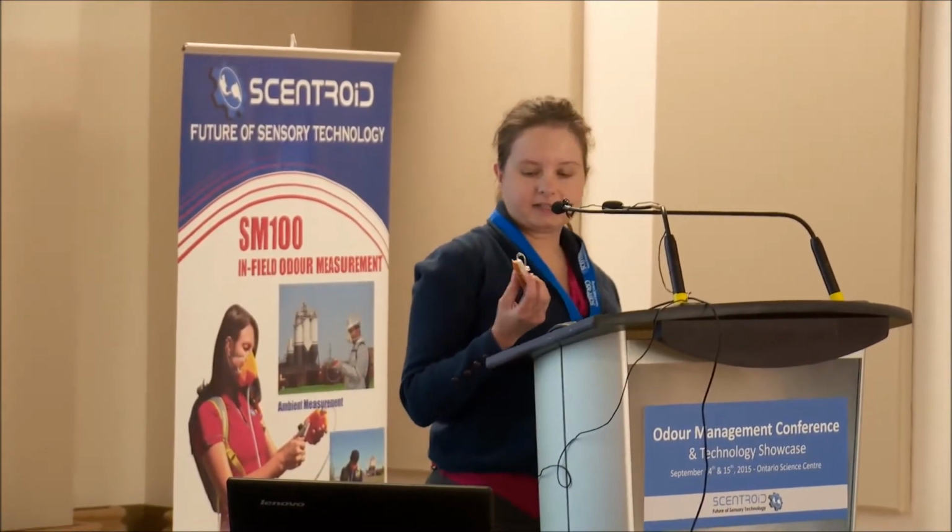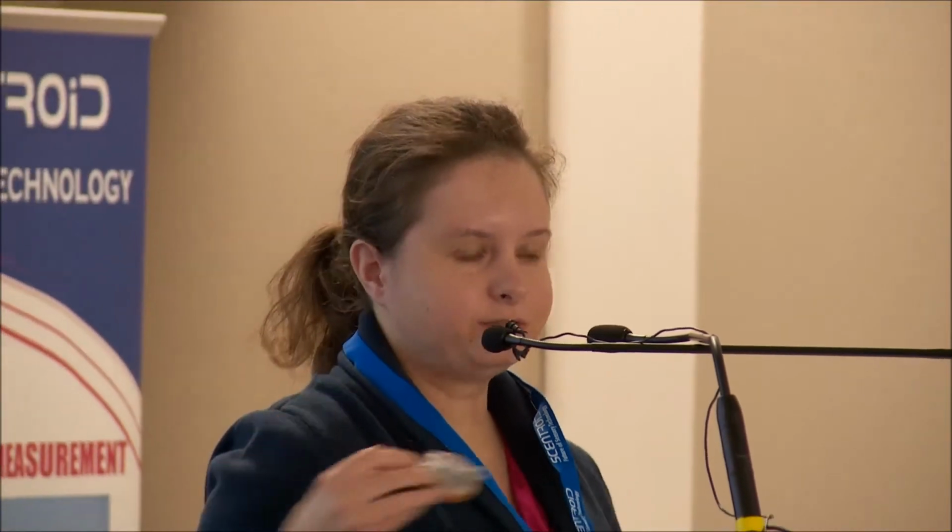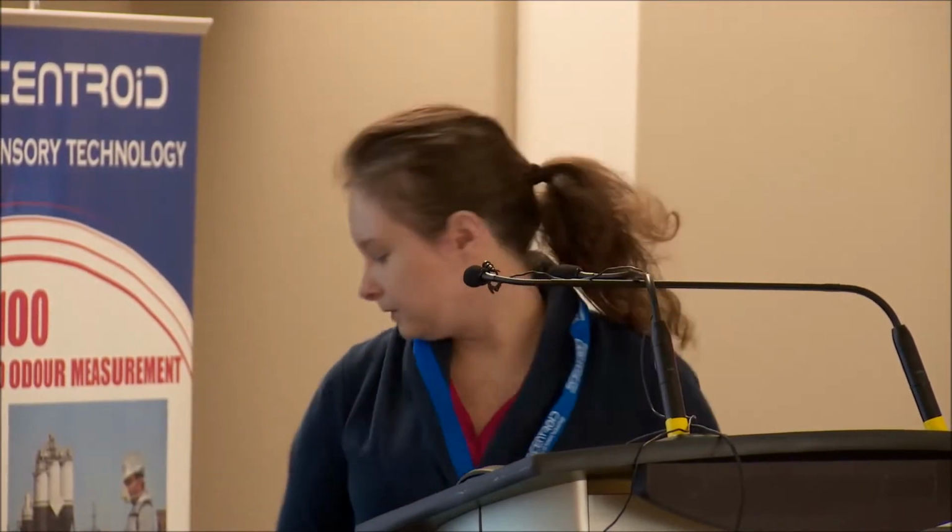If you look at something like a passive sampling device, it's quite small. It comes with a little clip and can be clipped on a fence line somewhere. And really, anyone can use it. You pop off the top, there's a membrane, you record the time you set it out, then you go off whatever amount of time you want to sample for, and then you retrieve it, put on an elution cap, and then you can ship it to a lab, and they're quite small, easy. But this won't work for a grab sample, so it's an integrative sample over a longer period of time.